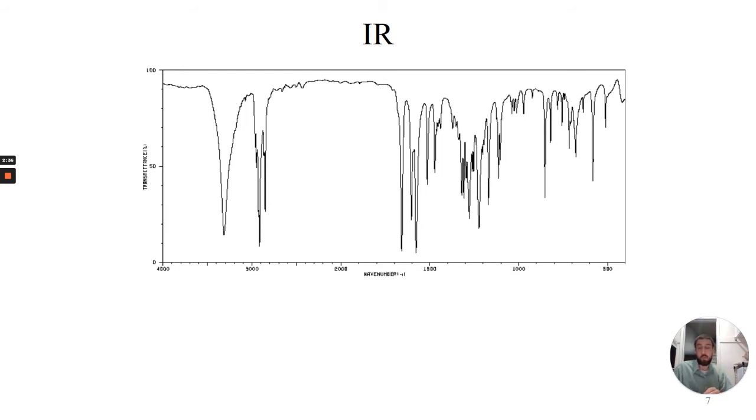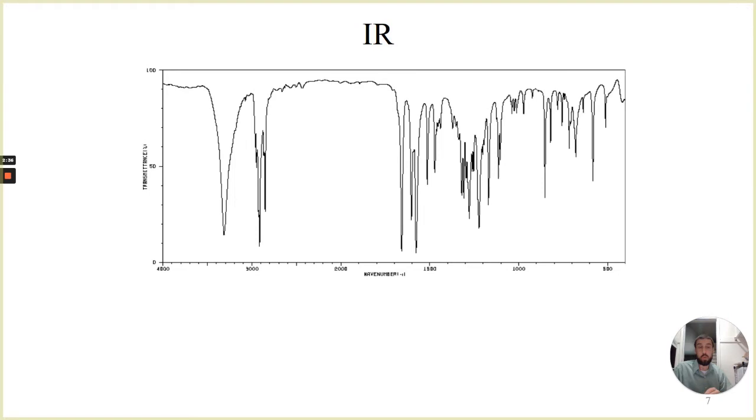And now, real quickly, what I would go through and recommend you do. So, I'm seeing an OH. This dotted line, these are under that, so I'm going to see C-H sp3 hybridized. 15, 16, 17, I got something, maybe 1650. That's a little bit dodgy. It's a little bit low for me to call that a carbonyl. I'm probably going to stick with it being a carbon-carbon. With there being another sequence or a bunch of sequences there, I'm going to bet that this is a carbon-carbon aromatic. So it's the combination of those.